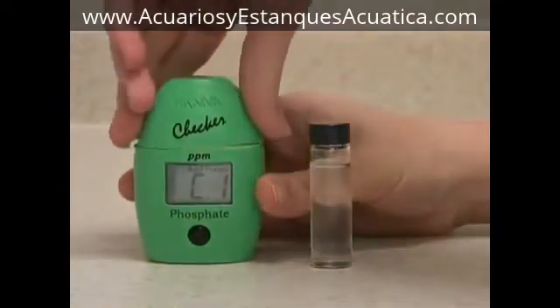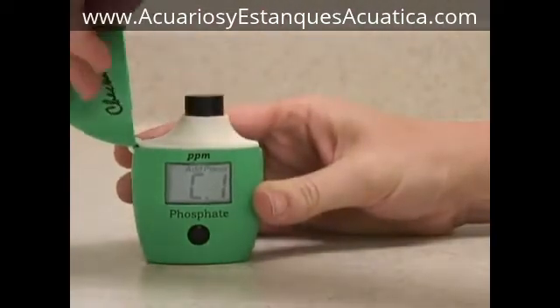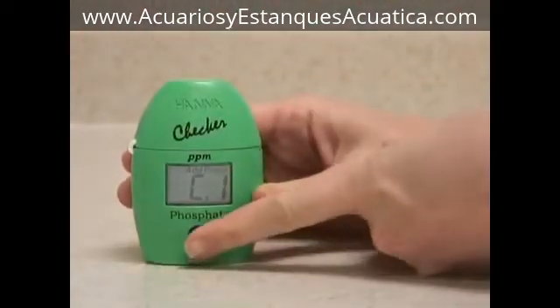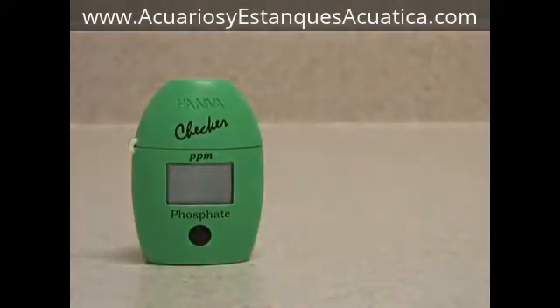you use a blank sample to zero the instrument. Insert the vial into the meter and press the button again. At this point, it will flash bars at you to let you know it's sampling.